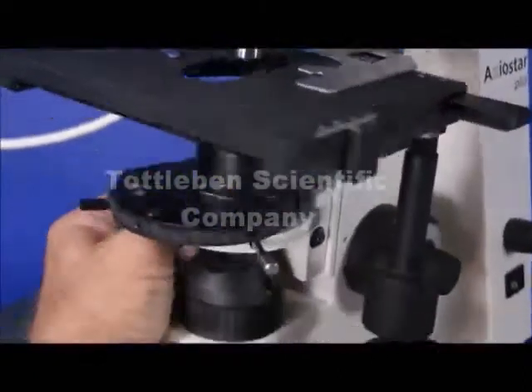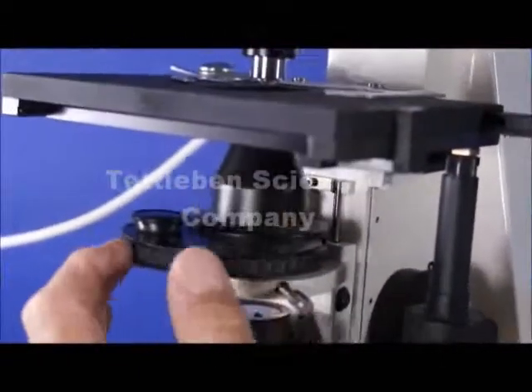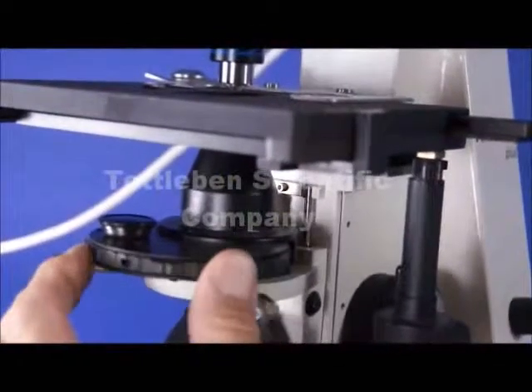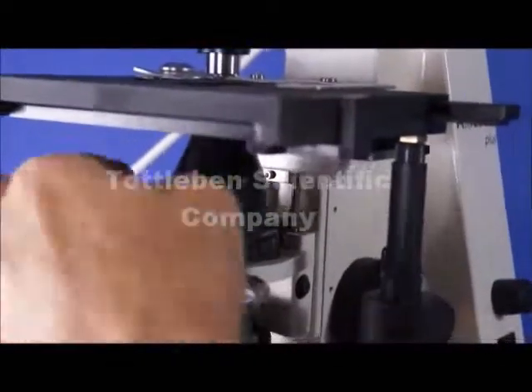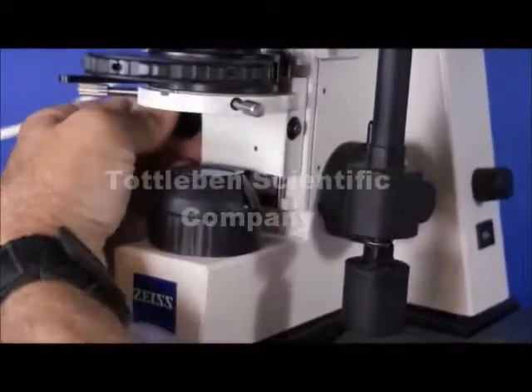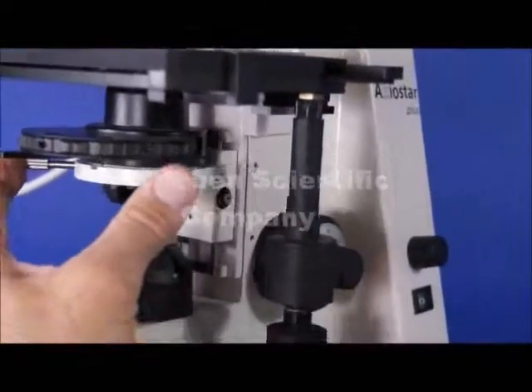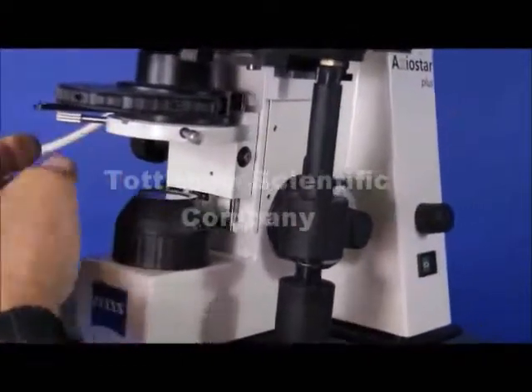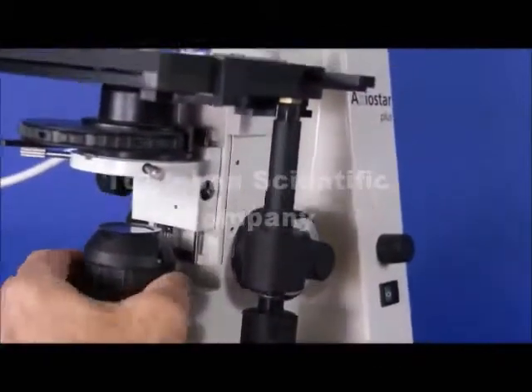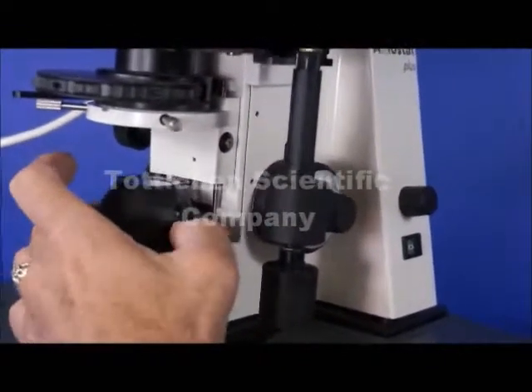Moving down the line there's a phase condenser which is outfitted with four phased positions, bright field and dark field. The condenser is both focusable and centrable, and you can also remove it easily for cleaning and adjusting. This microscope is also equipped with a field coaxial diaphragm so that you can set up for true Kohler illumination.